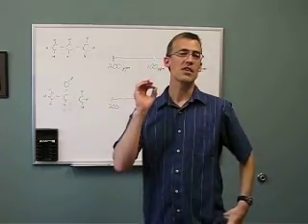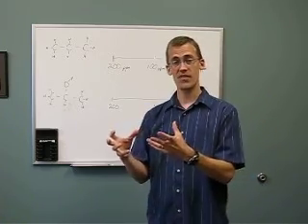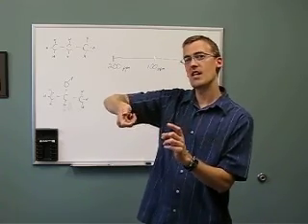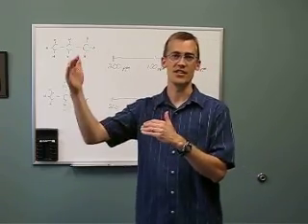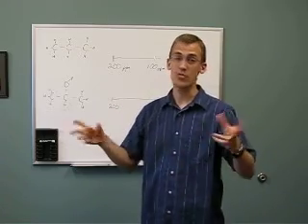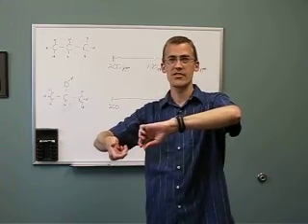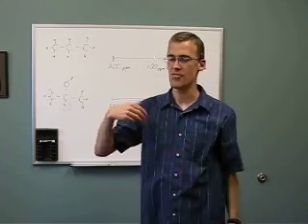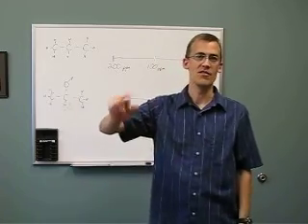Then, if we irradiate the sample with radio frequency radiation, and we give it just the right energy, these nuclei can absorb that energy and flip. And now they're spinning opposite the big powerful magnetic field. And this is the excited state. So we have ground state and excited state. If we pull the radio frequency away, so we turn it off, all the nuclei that were excited and fighting against the NMR magnet are all going to flip back. And if you turn on and off the radio frequency pulse, you get the nuclei flipping back and forth.